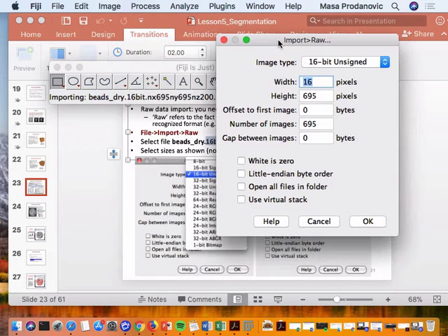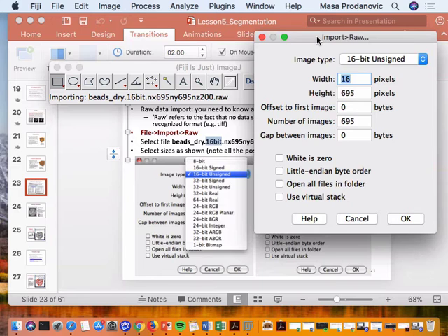And you know why? ImageJ is trying to be smart. 16, 695. So the first number is interpreted as a dimension. And this is something that has recently changed. I never had this problem with this, and I've been opening this file regularly since 2011. So it's trying to automate things, and I wasn't paying attention because obviously I need this cup of coffee.